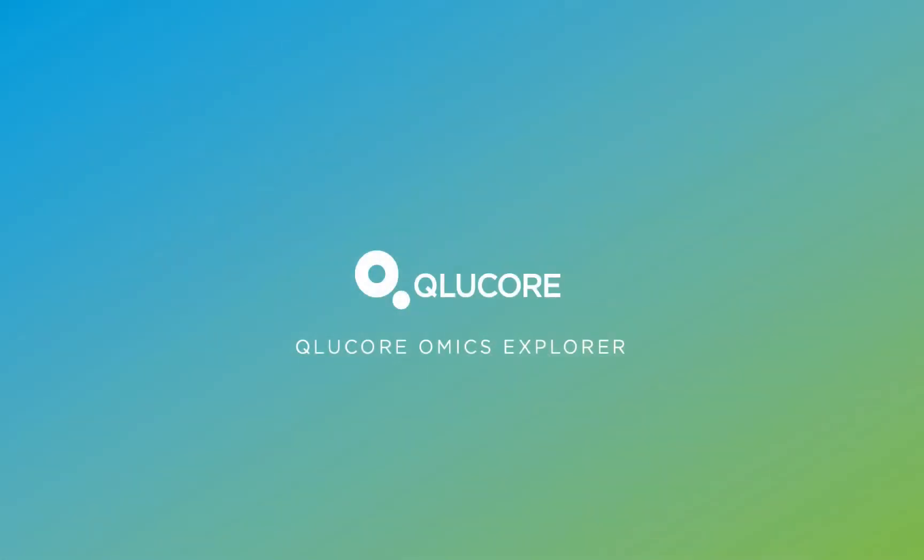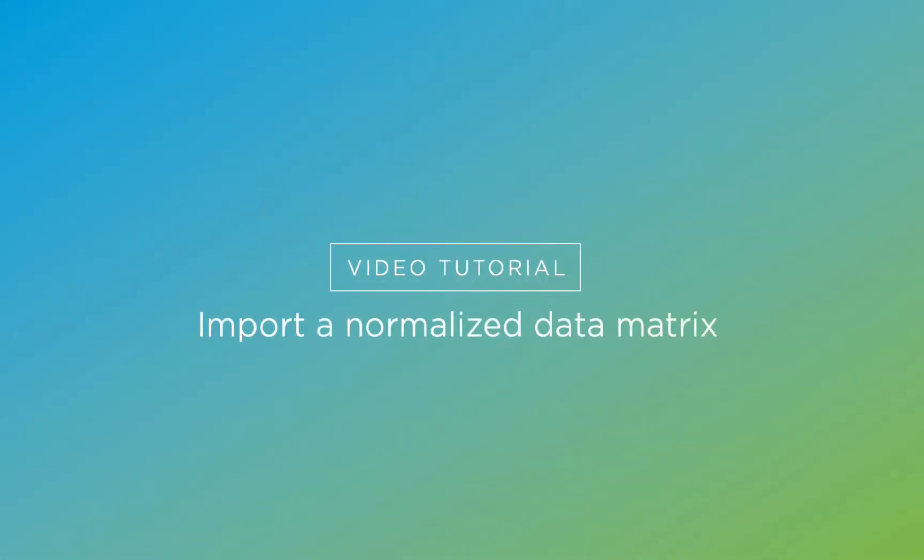Welcome to Qlucore Omics Explorer. In this tutorial, we will show you how to import a normalized data set using the wizard.